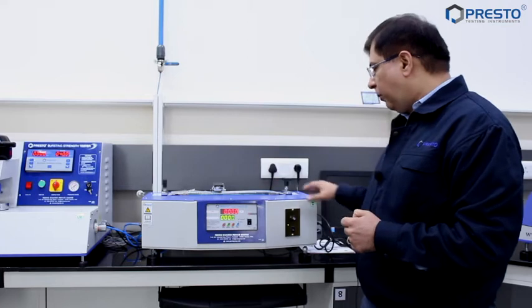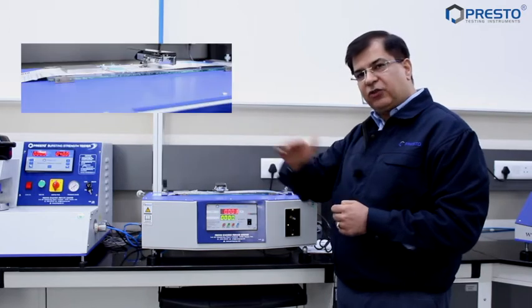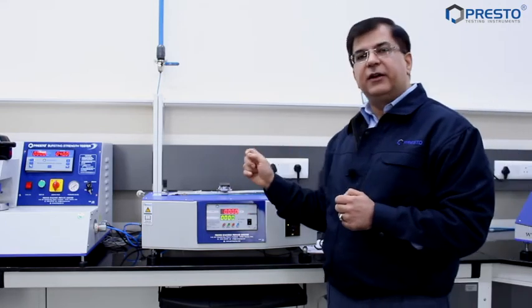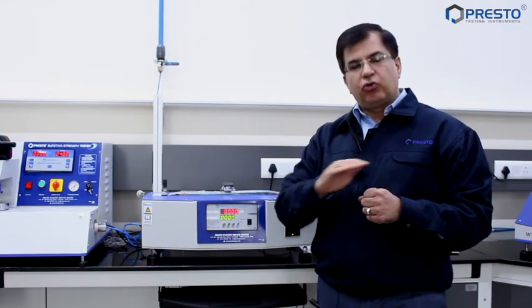Also, there should be no wobble in the equipment. If I start this equipment now, you can see it has to be ultra smooth. If there are wobbles, you can be sure that there is error in the readings. So whenever you buy equipment, make sure it runs this smoothly.